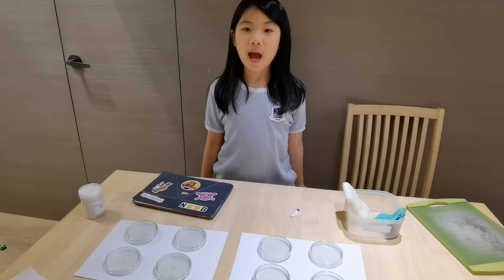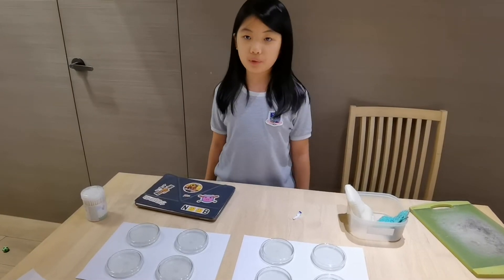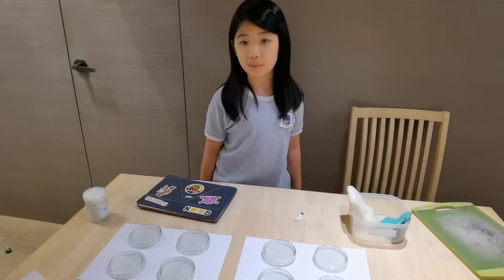At last, I will tape the petri dishes, write down their names and put them in a box.